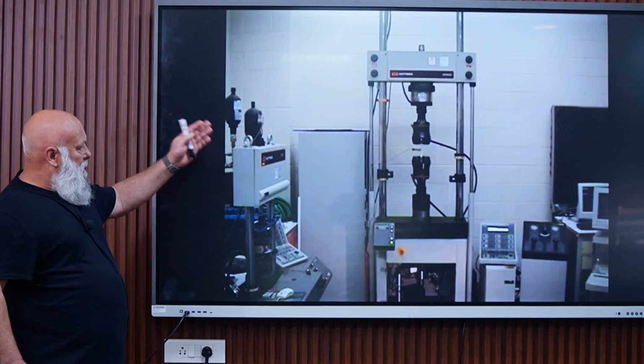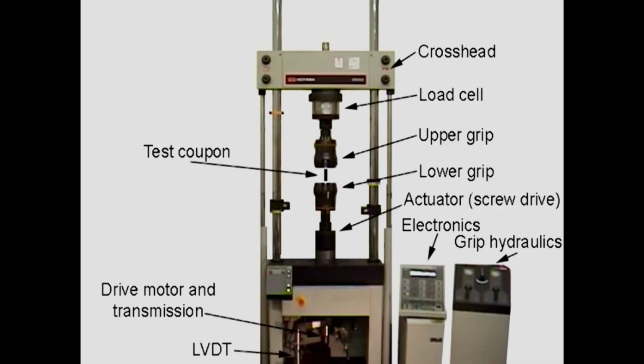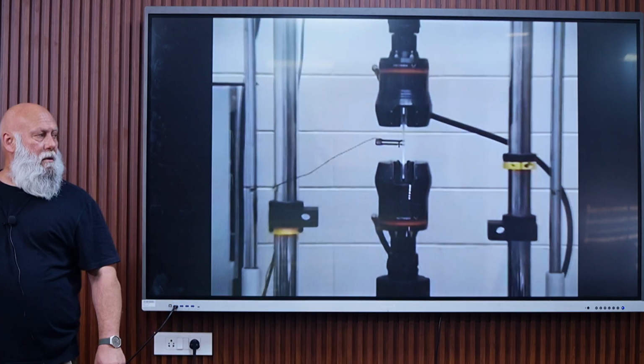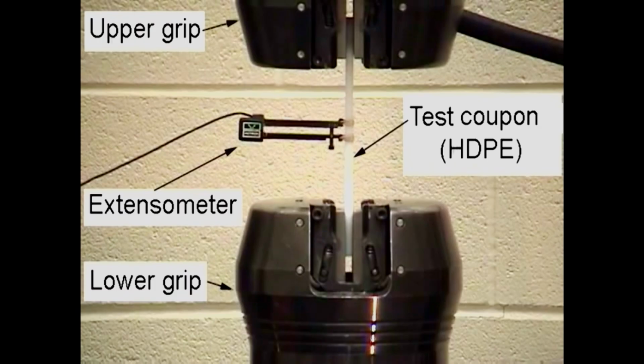So this is the tensile test machine with the sample, the upper grip, the lower grip, of course. We will see also, maybe later, yes, here, what is called an extensometer. The extensometer allows us to determine only the deformation where the sample has a constant section.